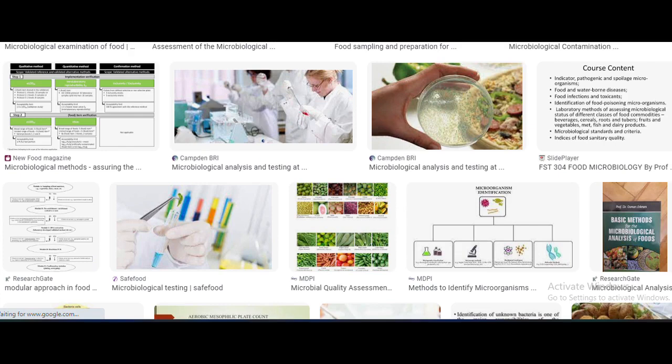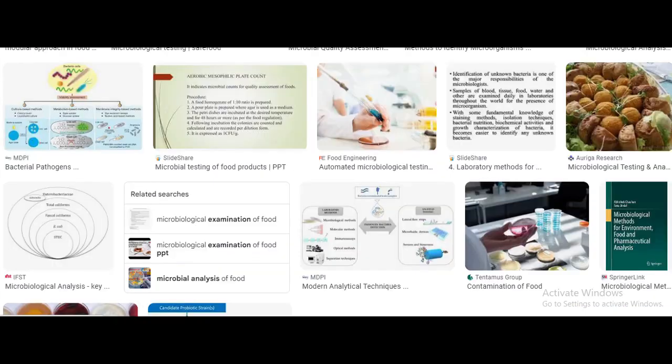So when a food is implicated, that is when you now start doing some tests. The isolation of specific pathogens, which may be present in very low but significant numbers in the presence of larger numbers of other organisms, often requires quite elaborate procedures. I've said that before. What is explained now is the concept of the indicator species.